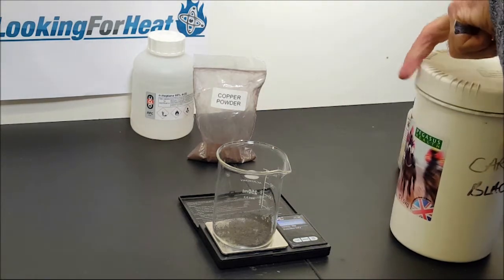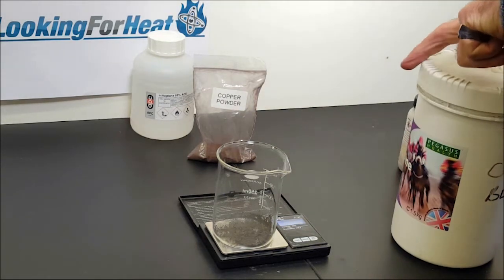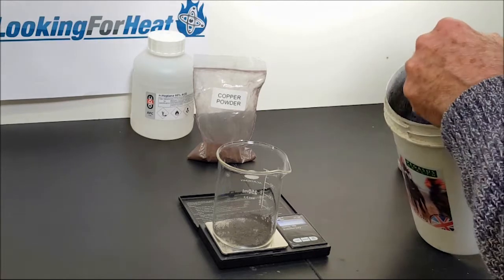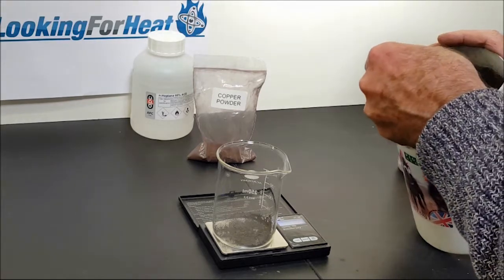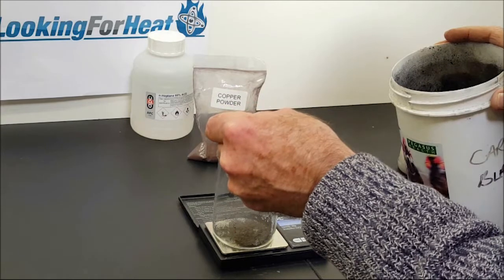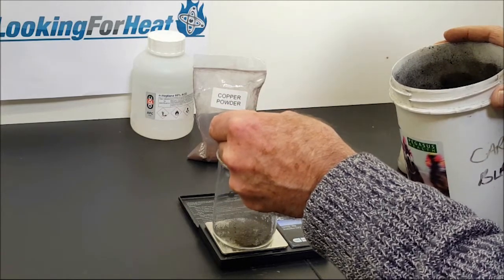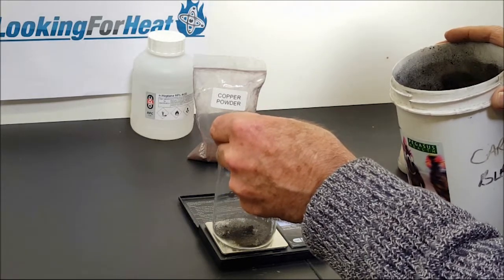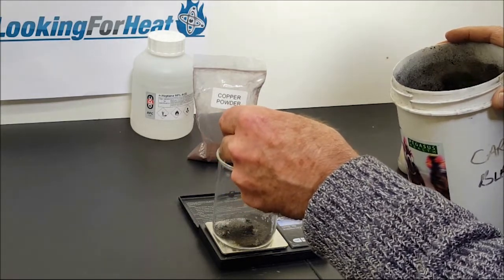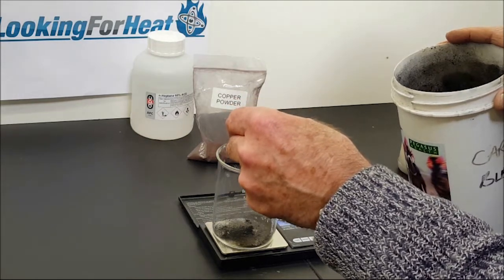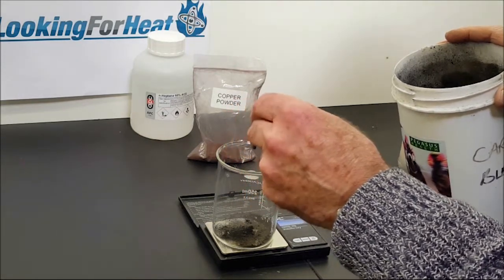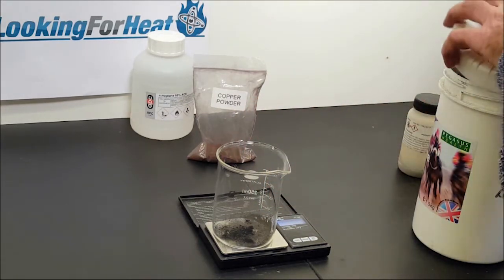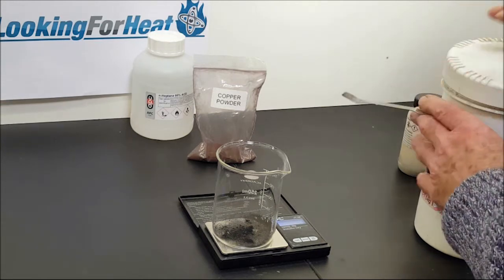The next step is to add 0.1 of a gram of carbon black. This is amorphous carbon black, very fine particles. There's a particular kind known as gas black because it's made by using a flame.